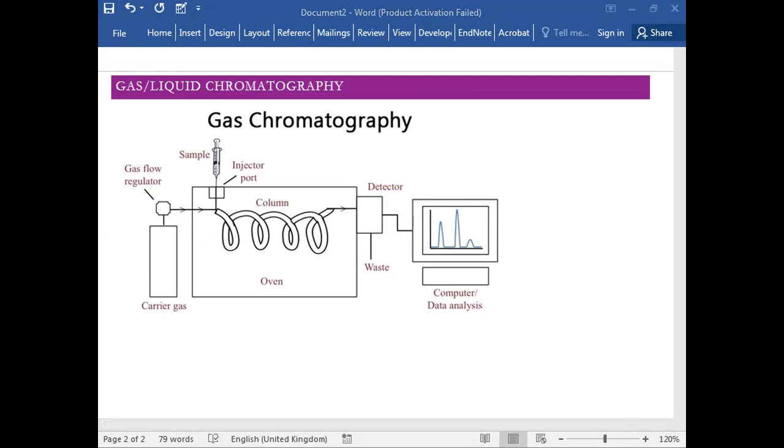Again, what is our stationary phase and what is our mobile phase, we need to understand this. इसमें the mobile phase is an inert gas, जो हम corner से गैस रेगुलेटर से we insert that gas. Not inert, sorry, in दूसरी भी होती हैं but majorly अक्सर वो inert gases भी हम use करते हैं. Helium use हो जाता है, other gases भी use हो सकती हैं.